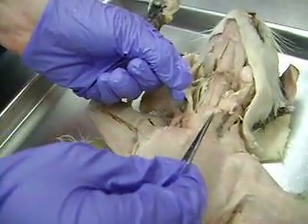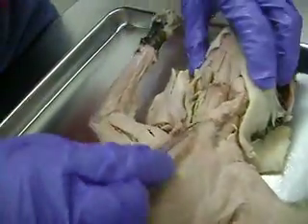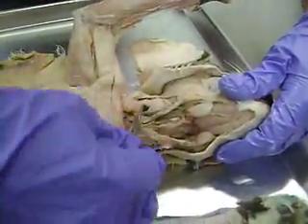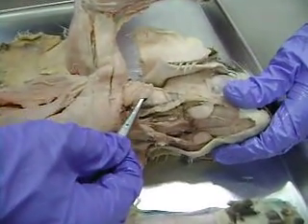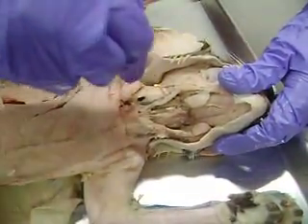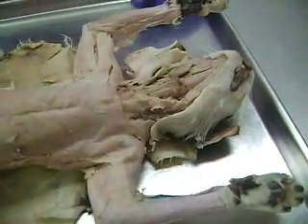And these two muscles here that I'm lifting up are the sternomastoid. And then if you come back from the sternomastoid, you'll find a deep muscle right here, and that is cleidomastoid. And then this would be the clavotrapezius that comes up the back of the neck. And that's it in the neck.